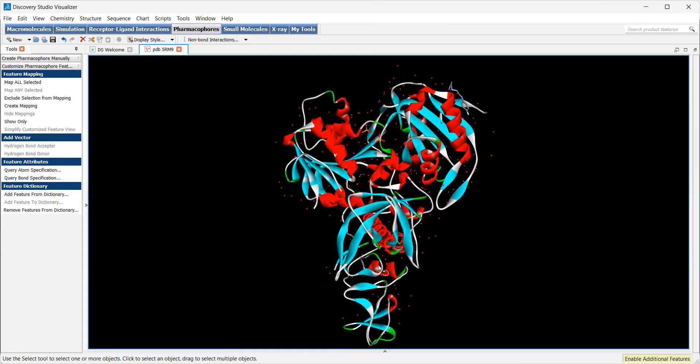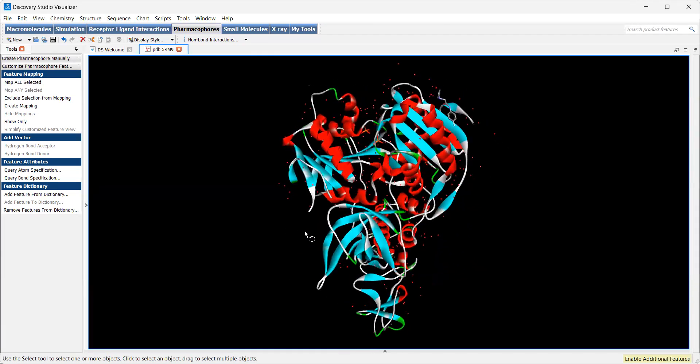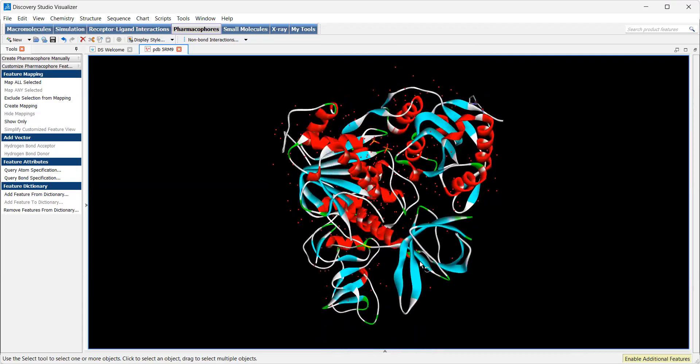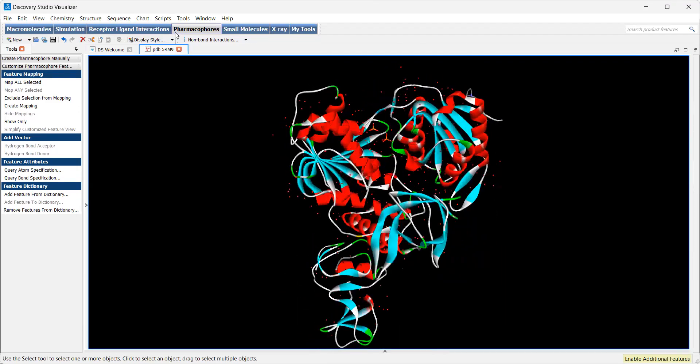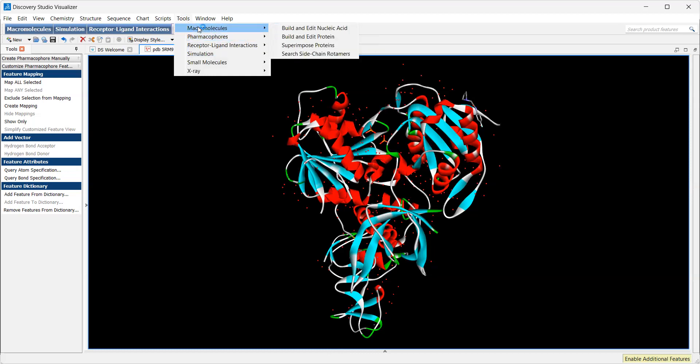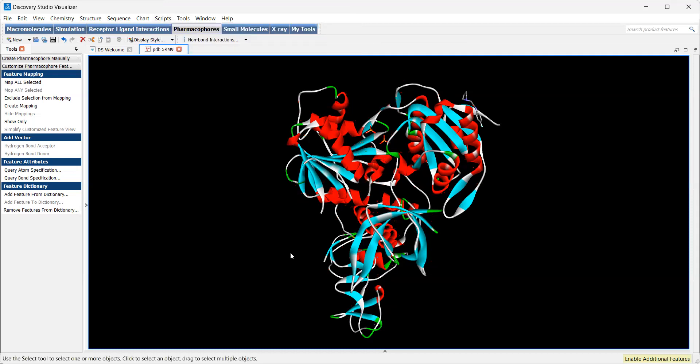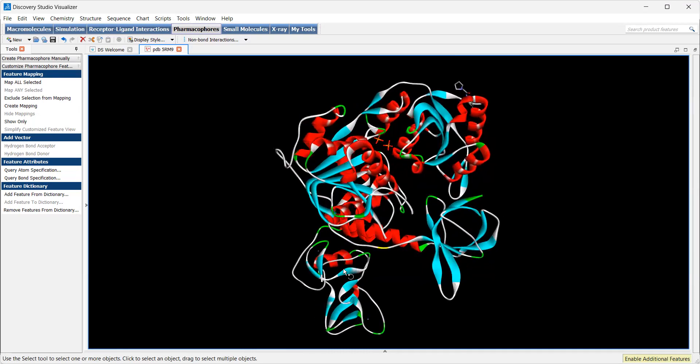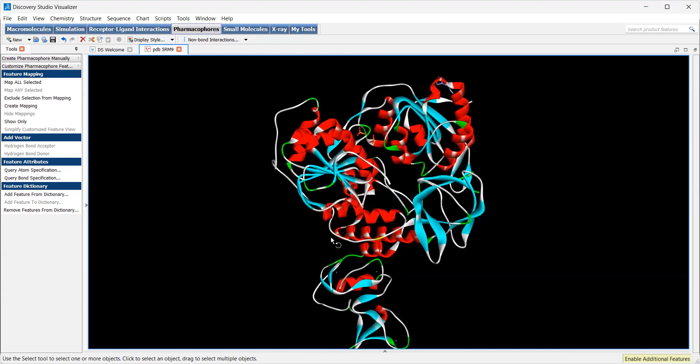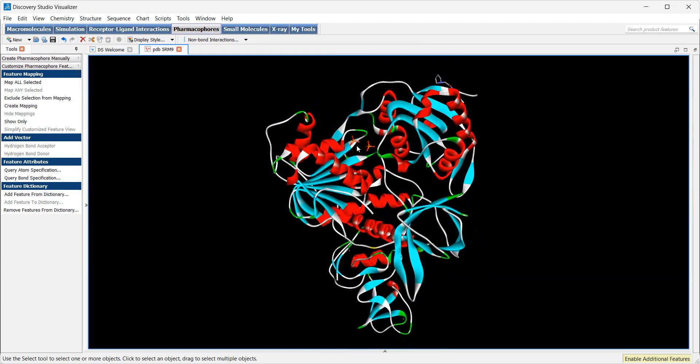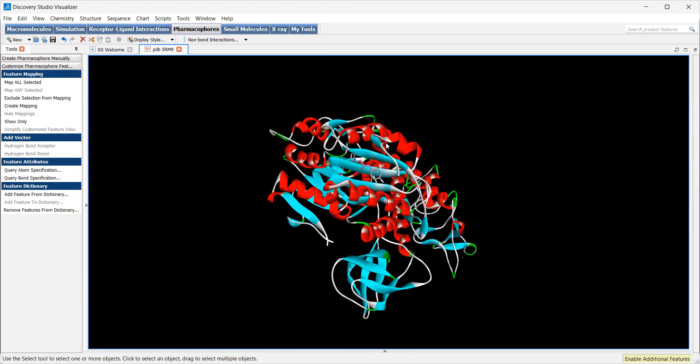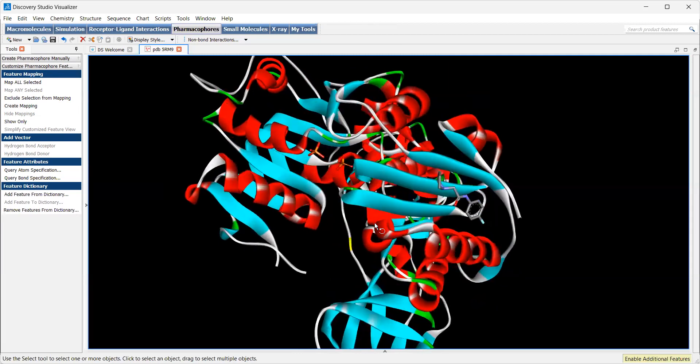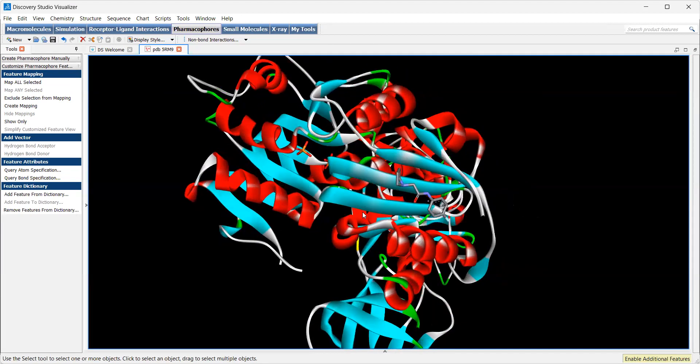You'll notice all the water molecules are present here, which we aren't interested in. So we are going to hide those waters, just get rid of those, so it's easier to interpret. This still keeps the non-standard residues, such as the phosphates and the zincs down in the zinc binding domain of the protein. And of course, it still keeps our ligand in the pocket.